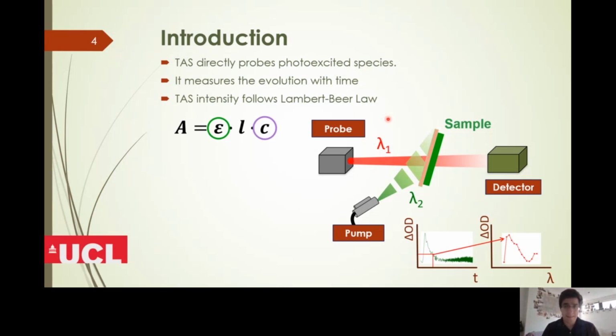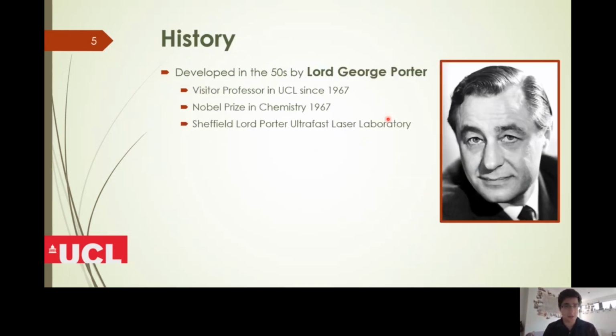This technique was invented by Lord George Porter. In the 50s, he was also a visiting professor at UCL in 1967, and in that same year he got the Nobel Prize in chemistry. As a curiosity, if you go to Sheffield University, they have an EPSRC facility where you can measure some picosecond TAS, and they named this lab after Lord Porter.